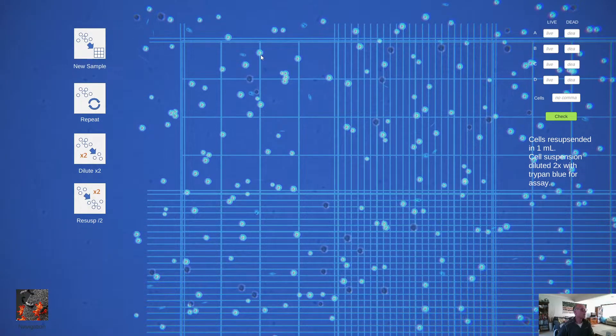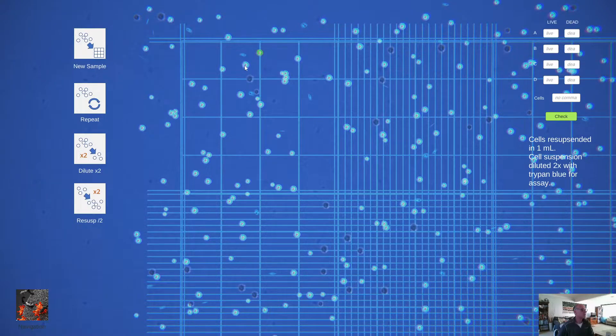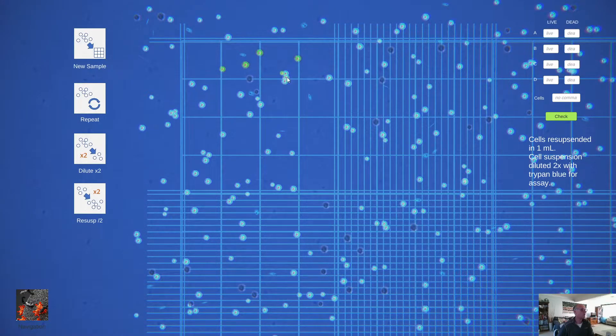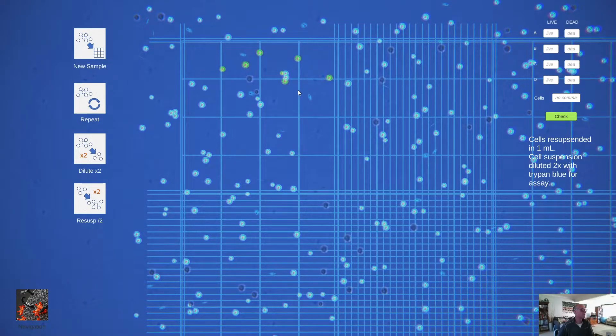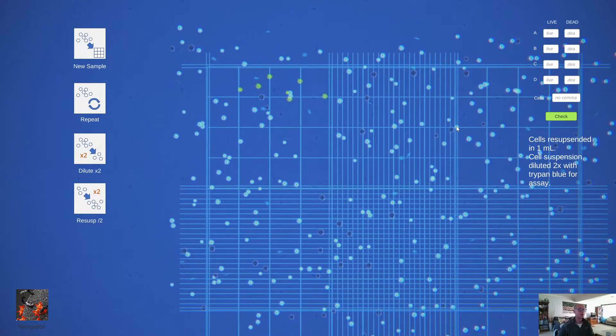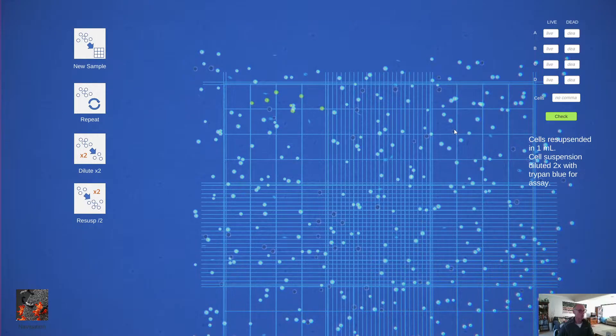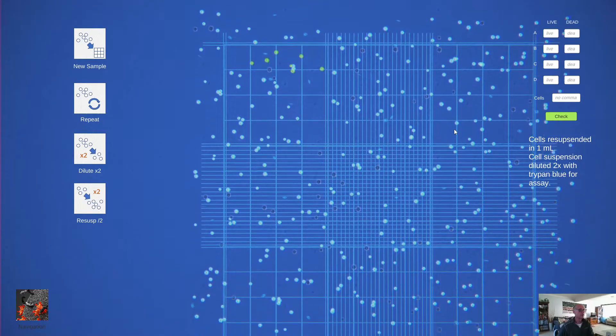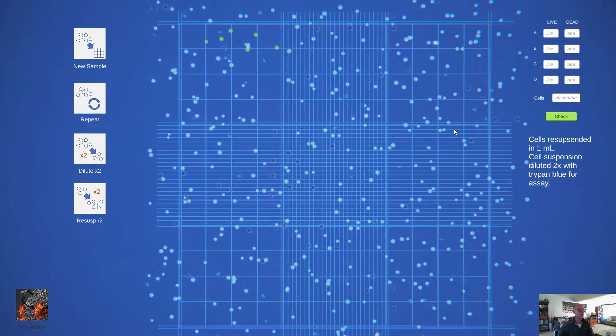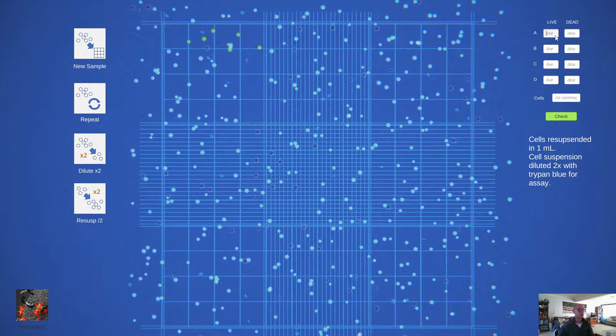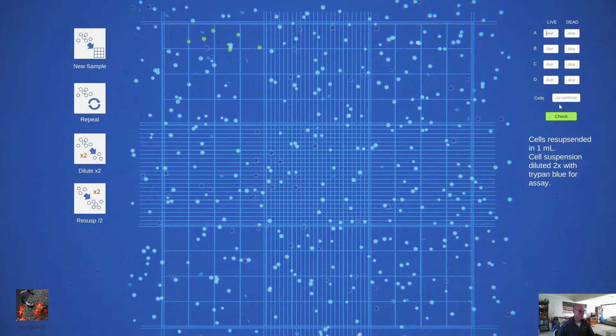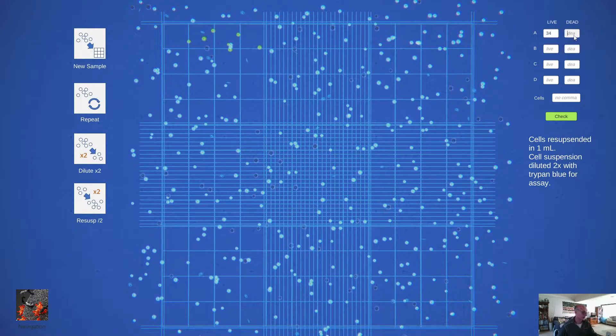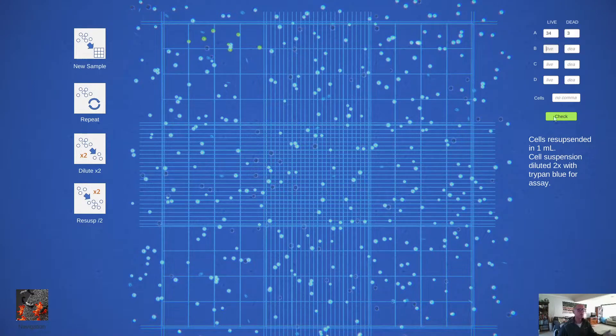We can select cells and keep a manual count, and then when we've decided how many cells there are in each quadrant, we can start entering them into this little grid over here. So just suppose I thought there were 34 alive and 3 dead and so on. I filled in all of that.